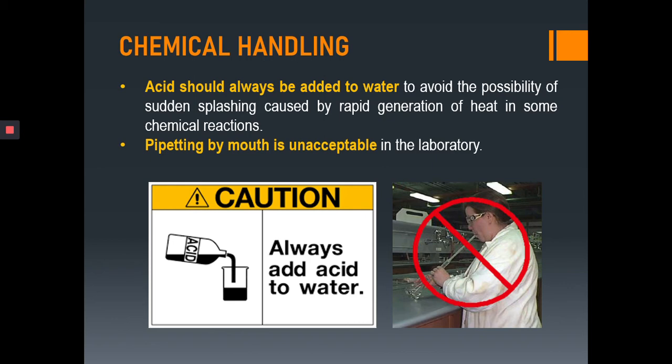Next, pipetting by mouth is unacceptable in the laboratory. I mean, if the sample is a urine sample, would you allow yourself to pipette the sample using your mouth? I don't think so. Nowadays, we already have serological pipettes and automatic pipettes that aid in the transfer of samples from one container to another.